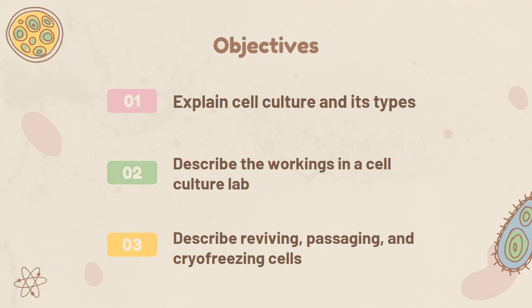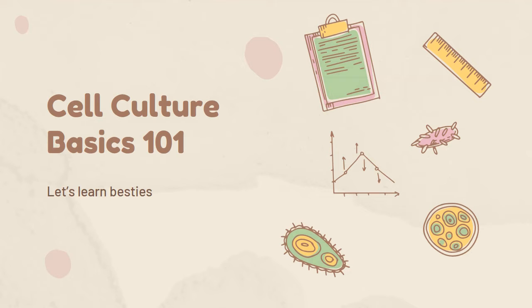In this report, we will be explaining cell cultures and its types. We will also describe the workings in a cell culture lab and describe the fundamental techniques such as reviving, passaging, and cryofreezing cells. So first, let's discuss the basics of cell culture.